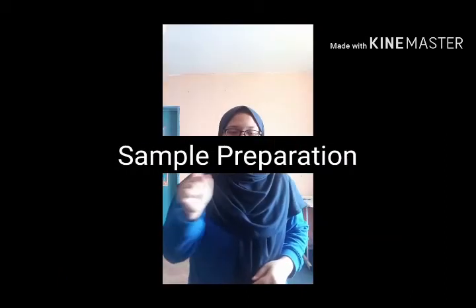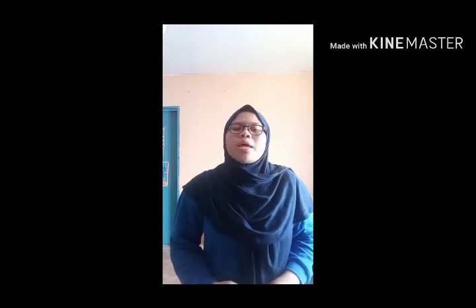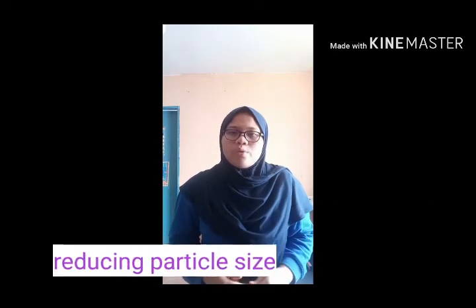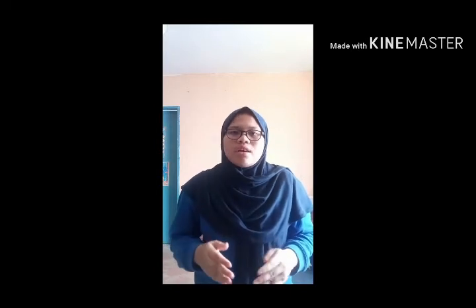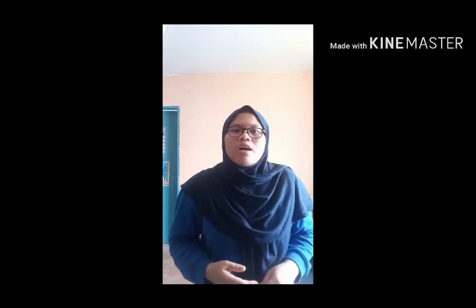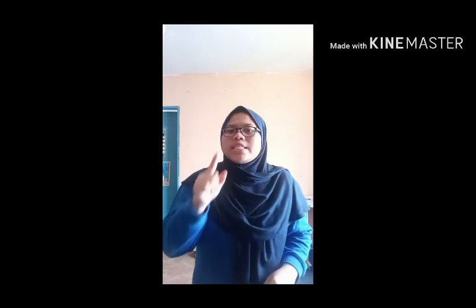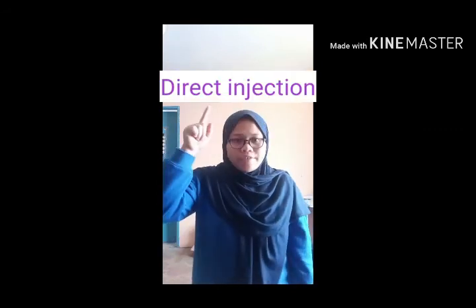The topic is sample preparation. Food products that are injected into gas chromatography cannot proceed without sample preparation. Sample preparation involves grinding, homogenization, or otherwise reducing particle size. So it needs a method to isolate analytes from food for gas chromatography analysis. There are five methods. First, headspace sampling, distillation method, solvent extraction, solid phase extraction, and lastly direct injection.